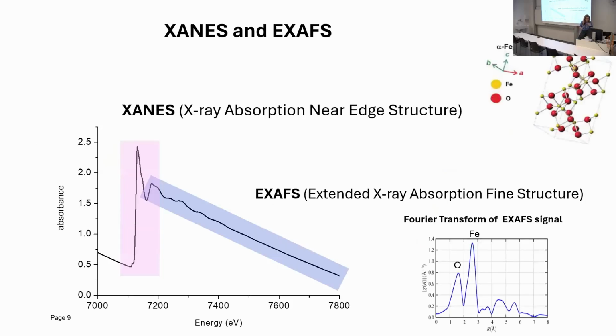But X-ray absorption spectra, as you see, also have fine structure. It's not just a simple threshold. This fine structure reflects the structure of the element. For example, here it's iron in the structure of iron oxide, and this spectrum is specific for this element in this state.